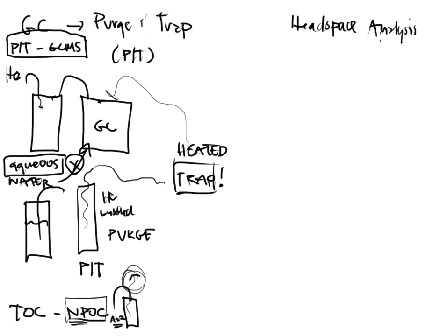Now let's turn our focus to the Headspace. The Headspace is also attached to a gas chromatography system in our laboratory, just like the purge and trap is. But let's talk about how the Headspace is a little different. In the Headspace, I typically have a liquid or a solid substance. I can measure either one here.